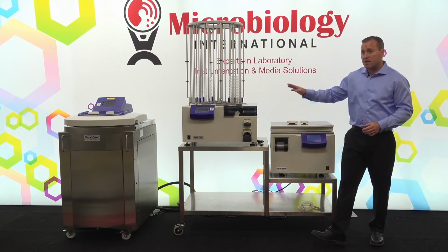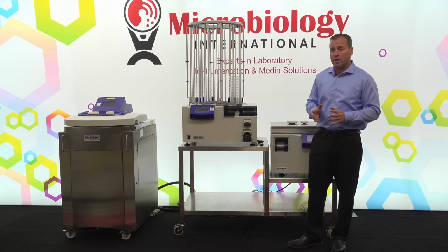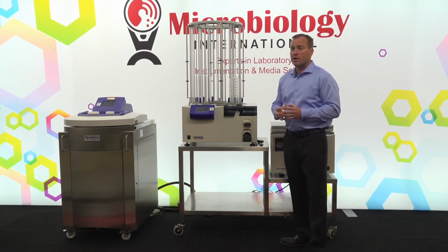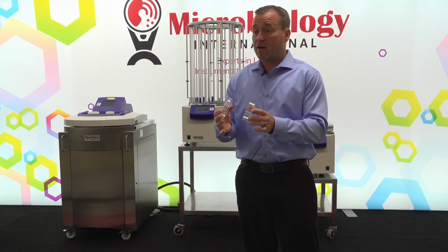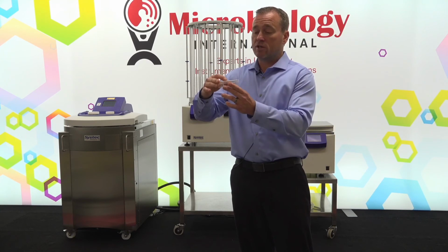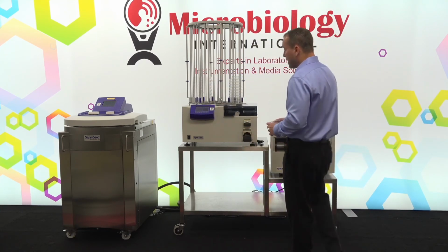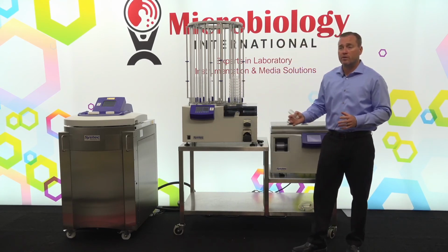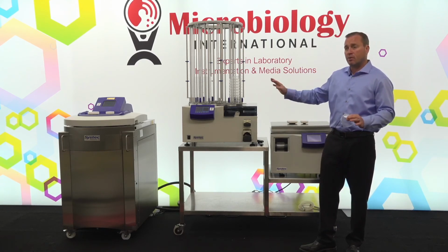As far as the MediaFill is concerned, we would recommend taking it apart and cleaning it at least every week. For sure every week, and then also anytime that there is a spill inside of the unit, we have sensors that will indicate whether we have a top and bottom to the plate, so it will dispense correctly and skip a plate if it doesn't open up. So sometimes there's static in here and the plate doesn't open, so it won't dispense into that. However, we can't detect whether there's a crack in the bottom of the plate. So if that were to occur and you did get a spill in the instrument, we would recommend taking the unit apart, giving it a nice and thorough cleaning, and then putting it back together.